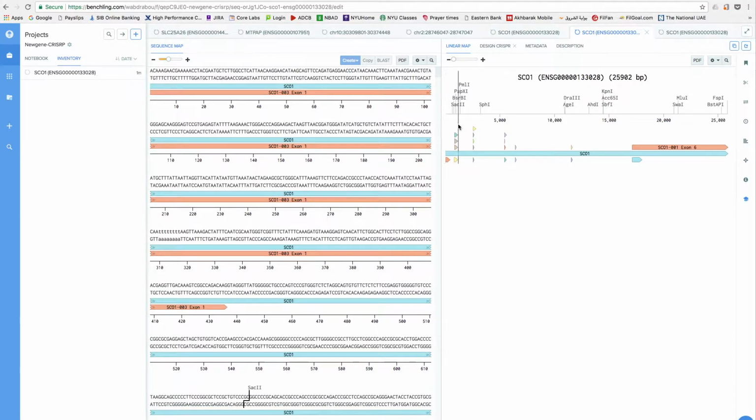So if we select exon 1, we have one transcript that we're not going to be able to do any editing in, just in case that was transcribed in our cell line. So what we're going to do is we're going to pick this one. Exon 2 seems to be the most ideal one. And one thing we do is basically we avoid the 5 UTR regions, and we also avoid the 3 prime UTR regions. So we're going to select exon 2, seems to be like the best candidate.